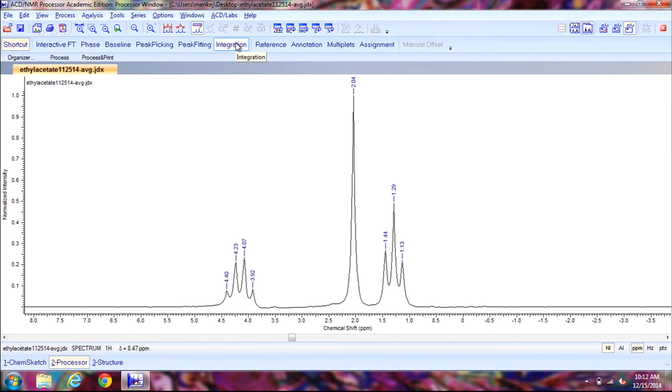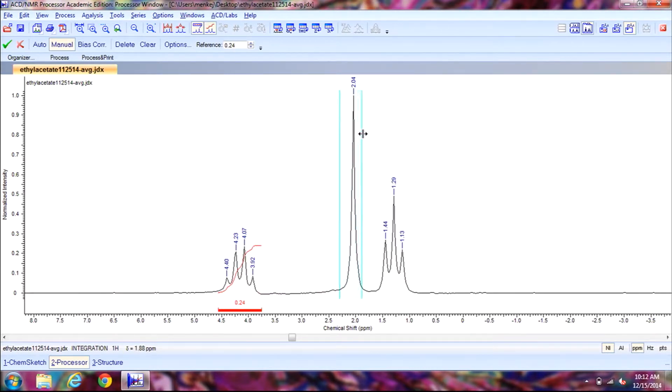Now we're going to click on integration. Again you might have an integration value provided to you by your instructor, but you're going to integrate by clicking and dragging for every single peak. Click to the left and drag all the way to the right, and do every single one for how many you have in your spectrum. Then to set the one that you know you can click on manual to exit out of that and then select the peak that you know the integration value for. So I know that this peak right here, the quartet, should have an integration value of 2. So I'll go up to reference and change this .24 to 2, and then that changes the value of the integrations for the other peaks for me as well. And now click on the green check mark.